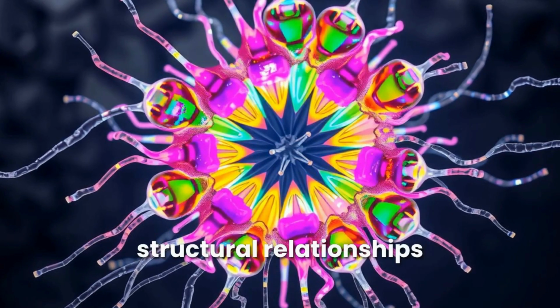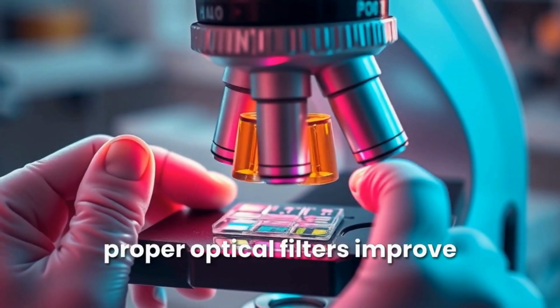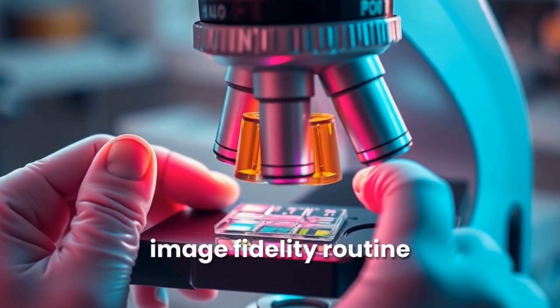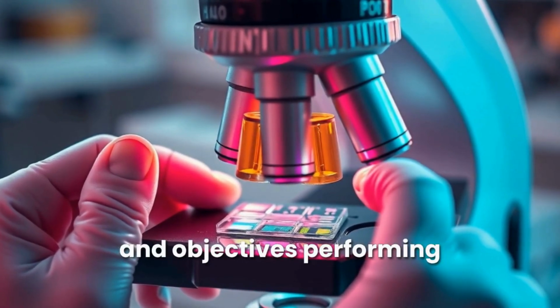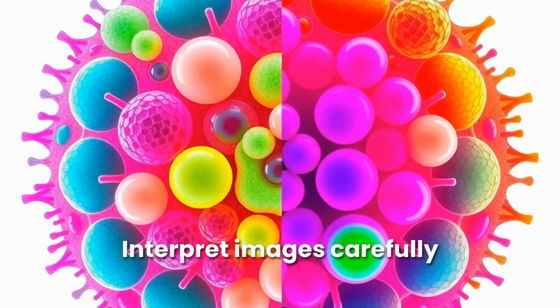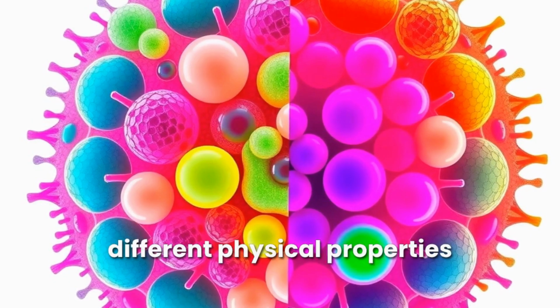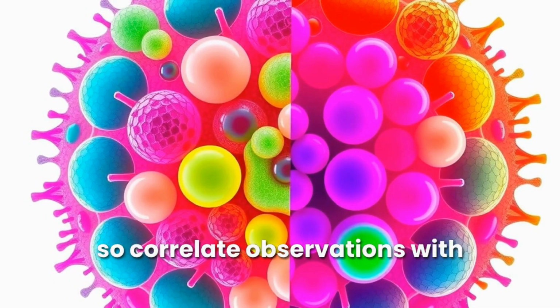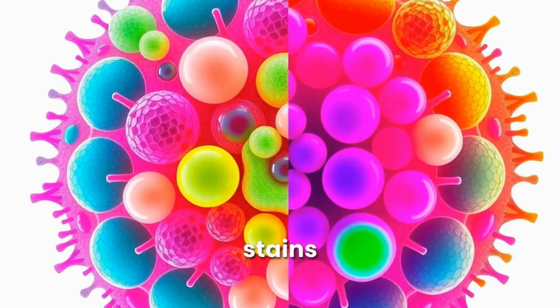Overlays clarify structural relationships. Calibration, alignment, and proper optical filters improve image fidelity. Routine maintenance keeps condensers and objectives performing optimally. Interpret images carefully. Contrast methods emphasize different physical properties, so correlate observations with controls and complementary stains.